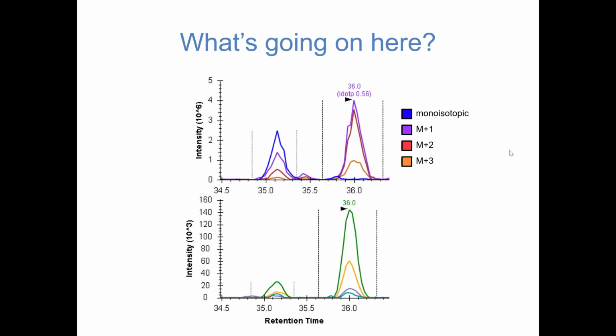So in this particular situation, we actually see a really good signature for what we're interested in measuring. This was a peptide that a friend of mine was analyzing. She left these samples in the -20 for, I think, 8 months or something like that, came back and reanalyzed them. Even in the -20, they degraded.